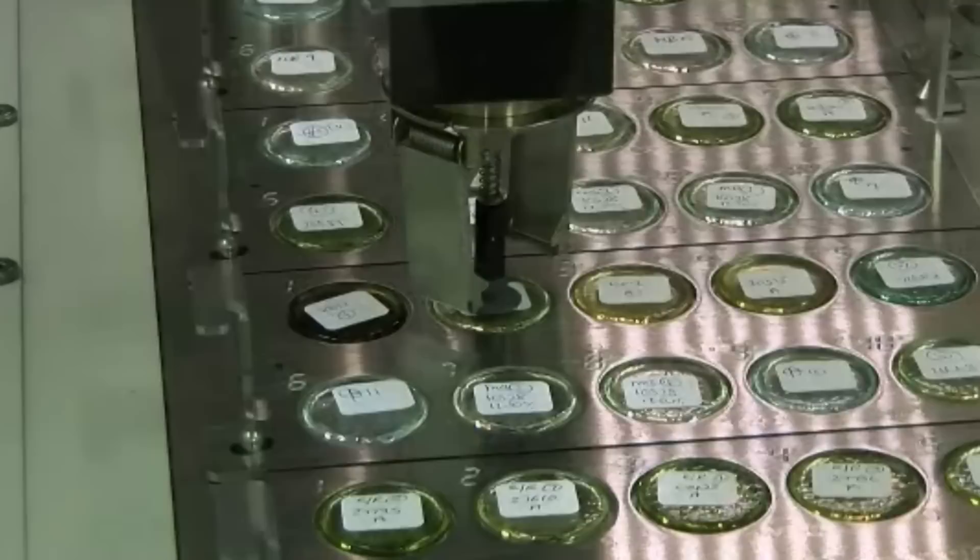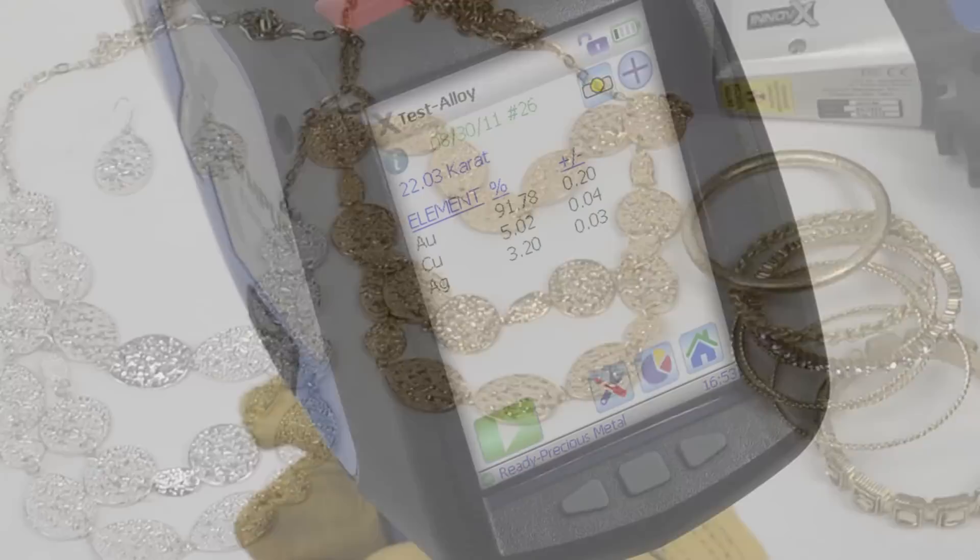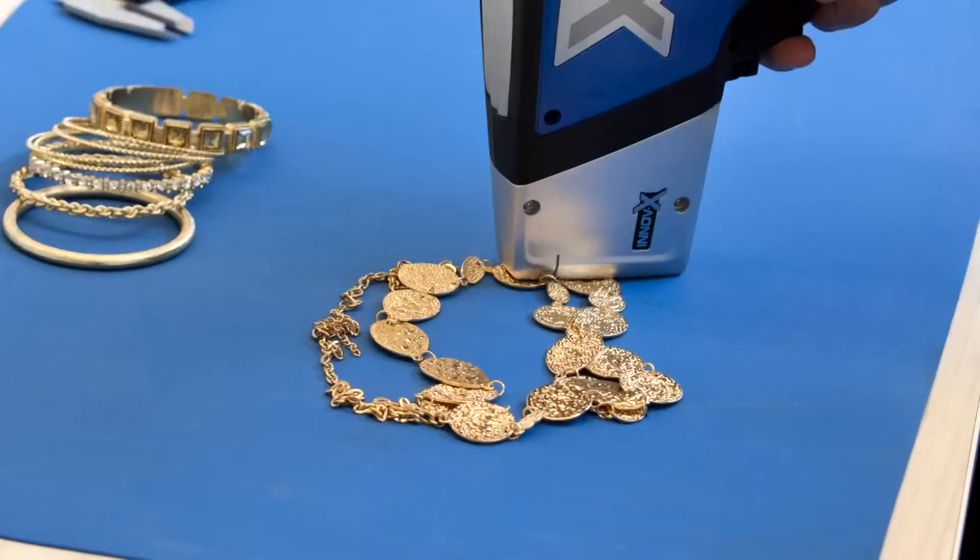Handheld XRF models have become an excellent tool for identification of alloys and is used to quickly identify the content of jewelry and other items—18 carat versus 14 carat, for example. However, it is important to remember that handheld instruments only analyze the surface.